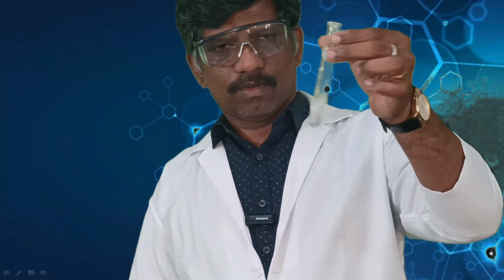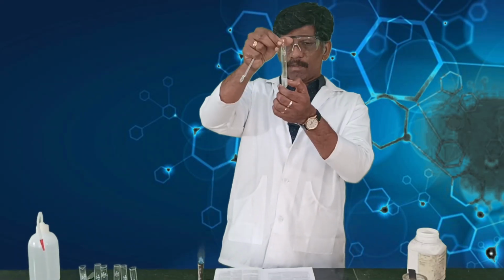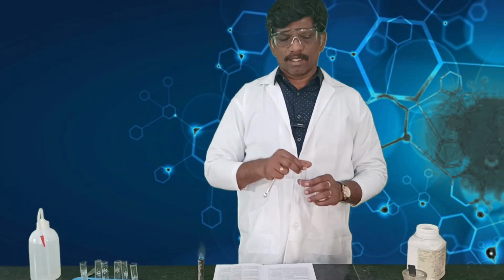You can see the brisk effervescence, or you can also hear it. If your substance gives brisk effervescence, then it shows the presence of carboxylic acid. If you don't observe any brisk effervescence, then the compound is not an acid.